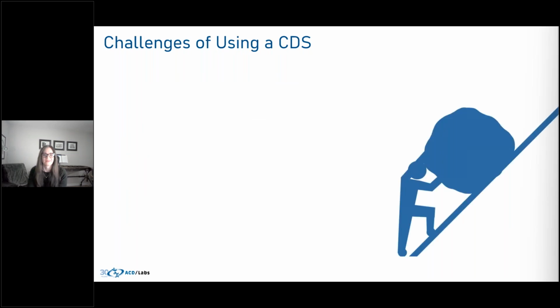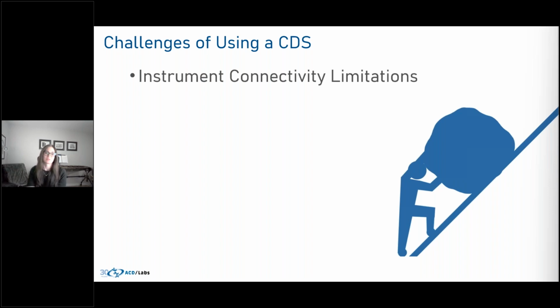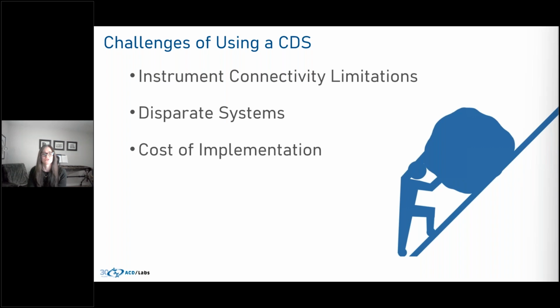Now, like I said, with any pros, there's going to be some cons. Some of those challenges that you might encounter: instrument connectivity. Not all instruments may be compatible with a single CDS system. This would lead to integration challenges as well as disparate systems, which have the added drawback of needing to learn another piece of software. There's also costly implementation. The initial setup and maintenance can be quite high, especially for smaller labs.